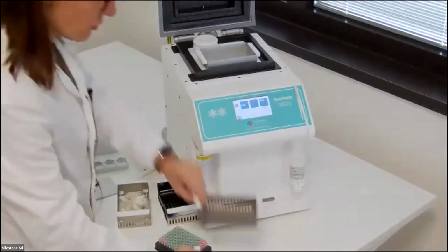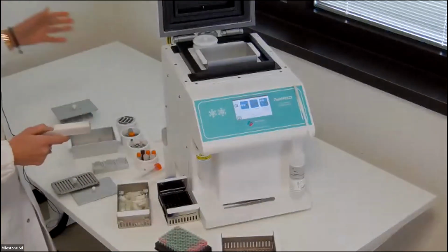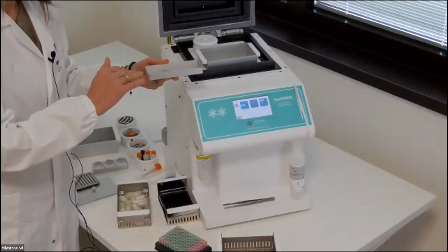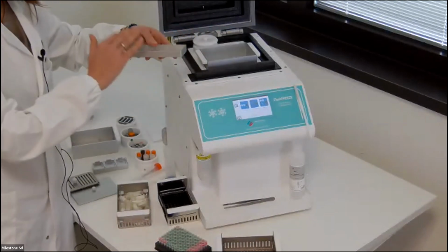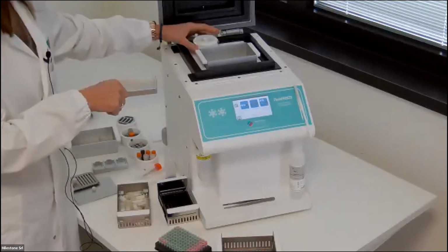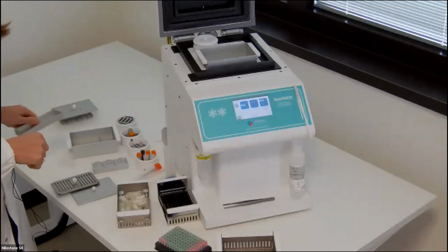Of course, sorry, Michela, in case of cryomold, the level is done by this set level container. So this must be maintained full. Okay, also using this spare liquid in the spare container.